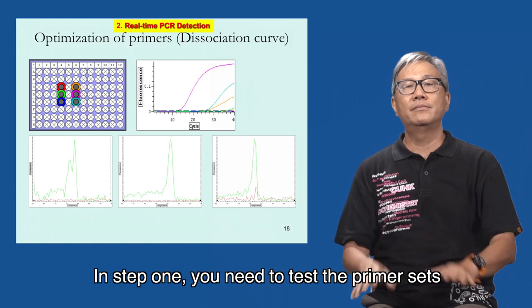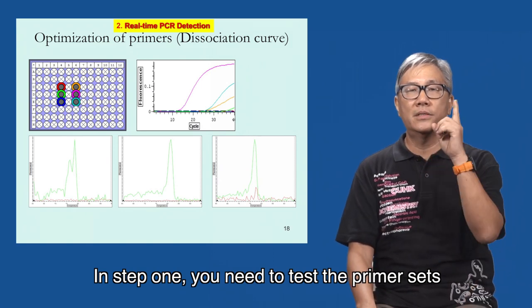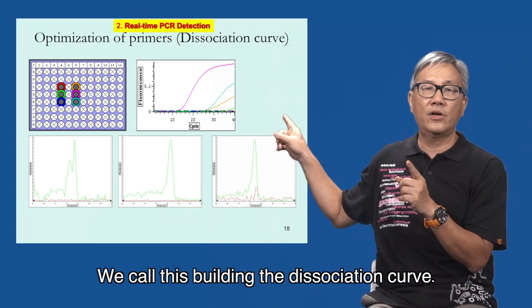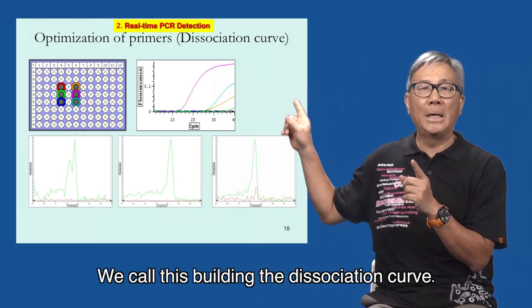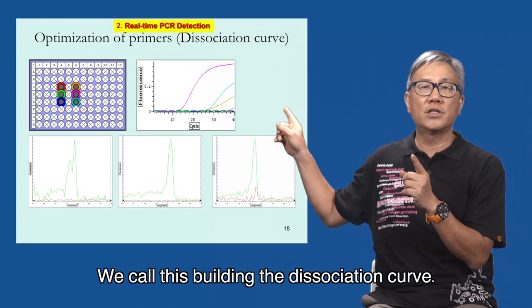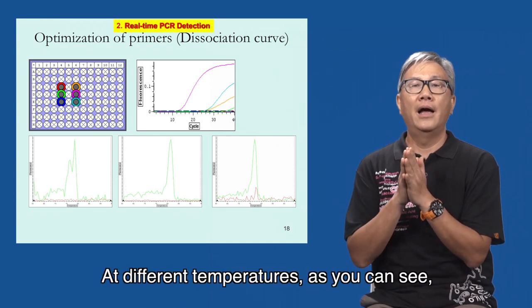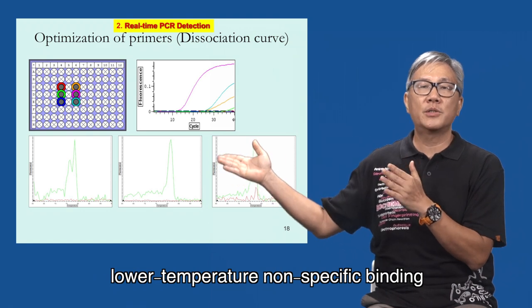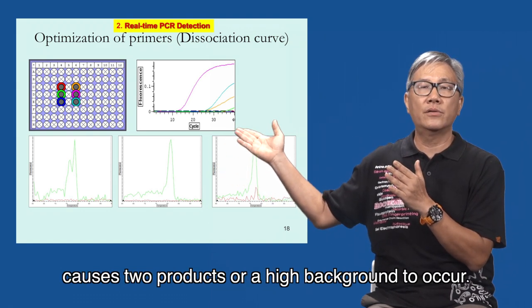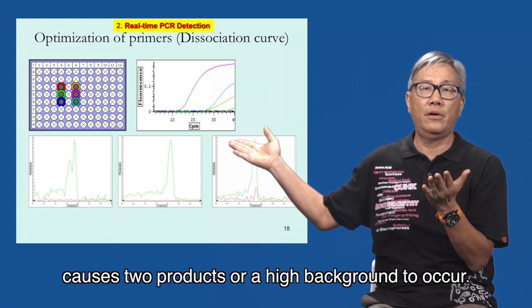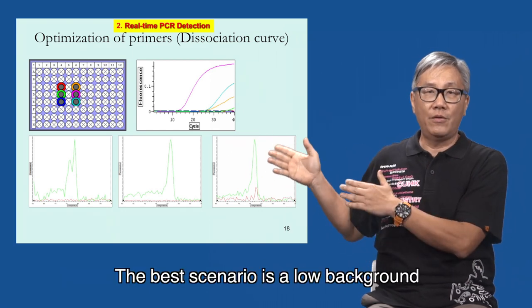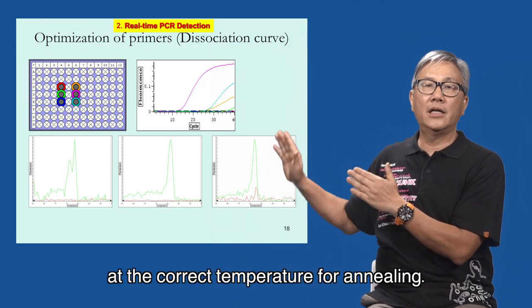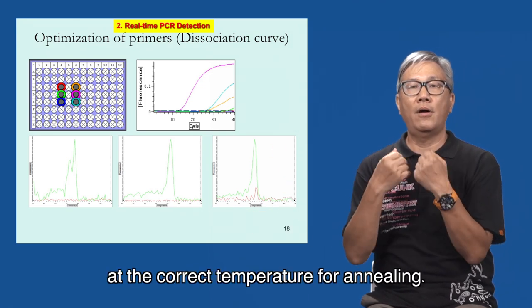In step one, you need to test the primer sets with different annealing temperatures for real-time PCR. We call this building the dissociation curve. At different temperatures, as you can see, lower temperature, non-specific binding causes two products or a high background to occur. The best scenario is a very low background with a sharp peak at the correct temperature for annealing.